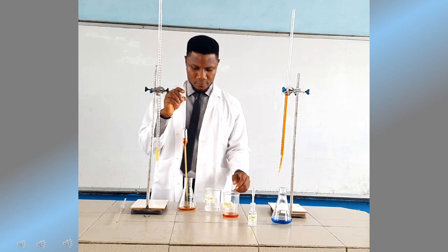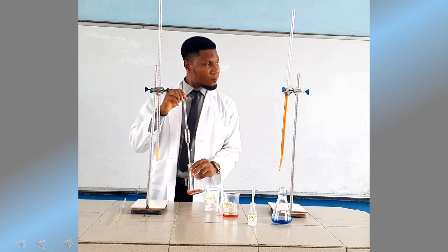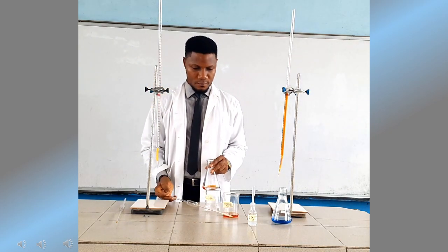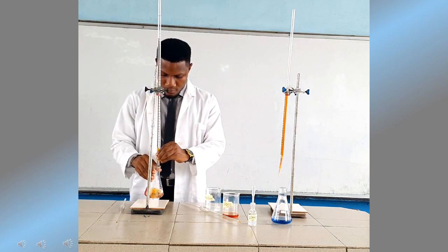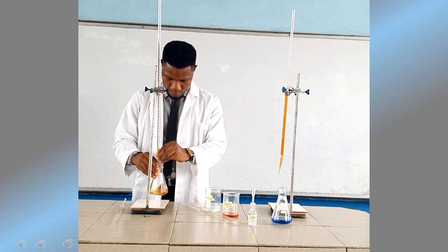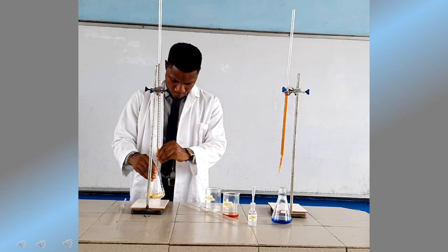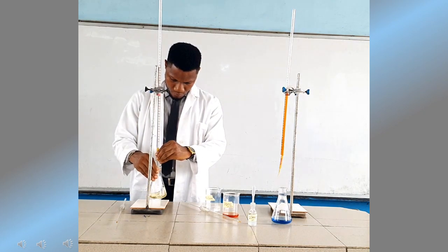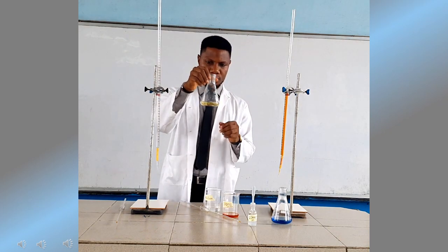Then, take note that indicator is not added at the beginning of this titration. In other words, the titration will proceed until it gets to the middle, where we have a pale yellow solution in the conical flask. Just as we're doing right now, we're titrating until we get a pale yellow solution. Yes, a pale yellow solution. That is it.